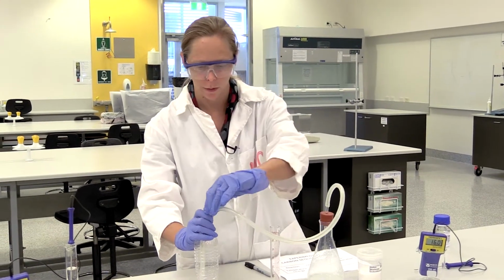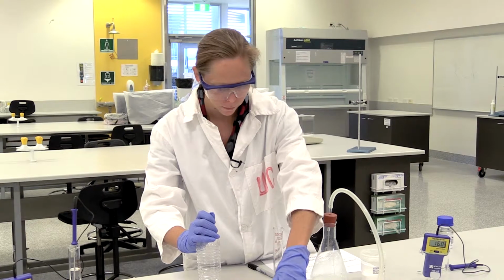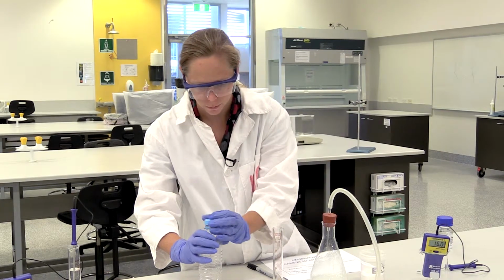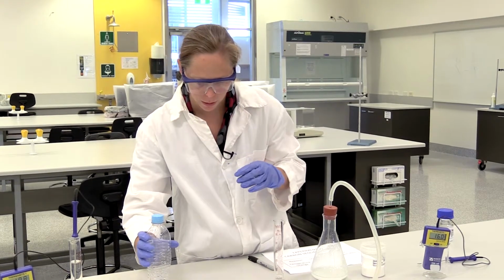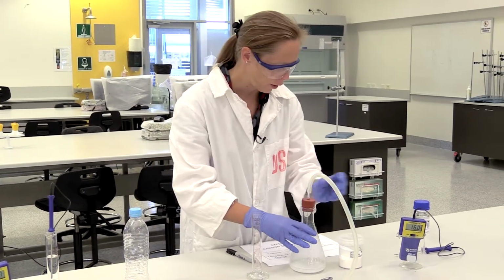Okay, so I now have a bottle of carbon dioxide. And I need to measure the temperature of my final reaction vessel.